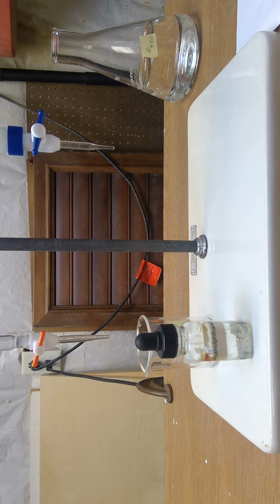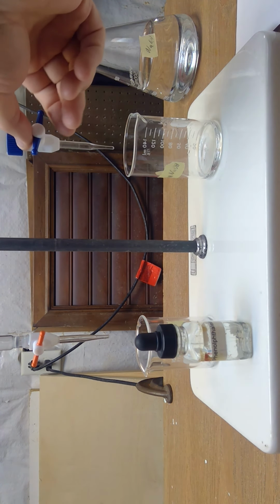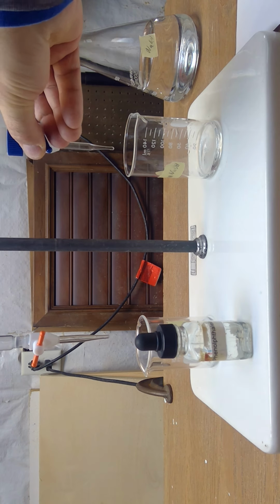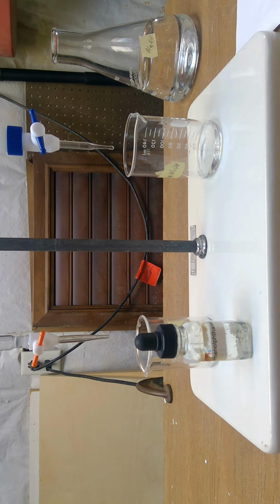Now I'm going to go to 20. Okay, so I'm going to zero this at 20 because I only need 20 milliliters. So I'm going to come down to 40 again, and it'll be plenty. So I'm going to re-zero this at 20. So we're re-zeroed at 20 milliliters. So our initial volume this time for our NaOH is 20.00. Our initial reading for our vinegar is going to be 34.00. And we're ready to do our third trial.